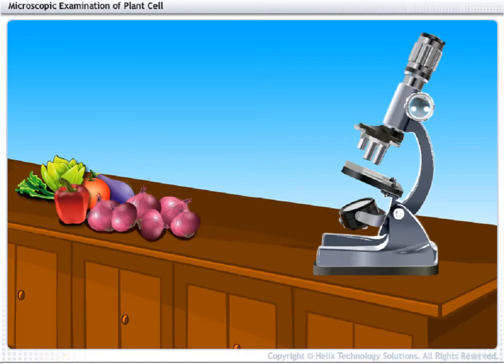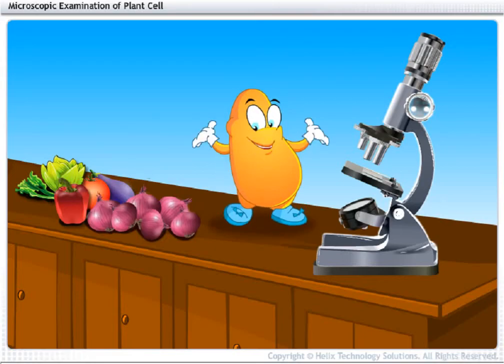Let's do a microscopic examination of a plant cell. Now this is going to be fun.